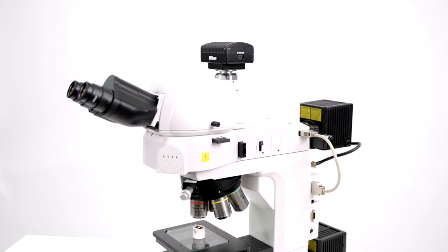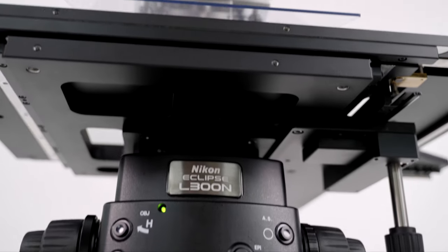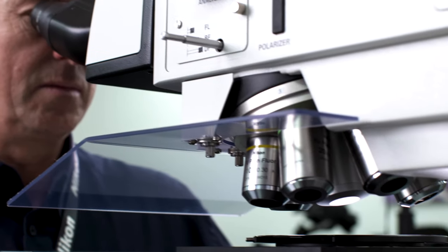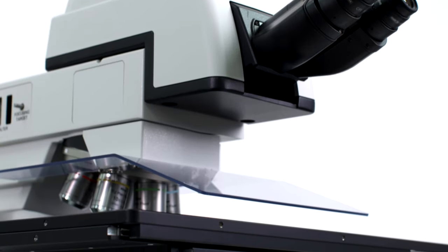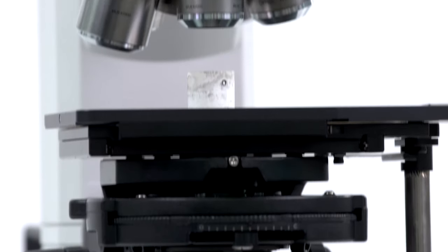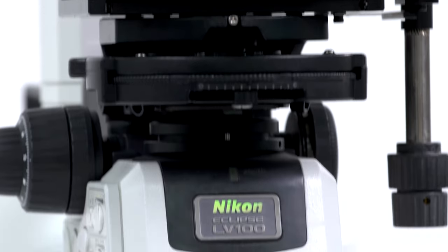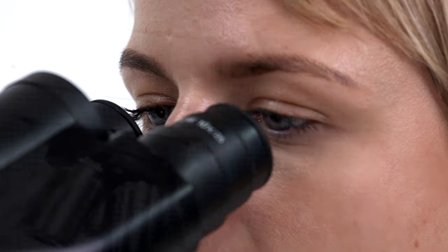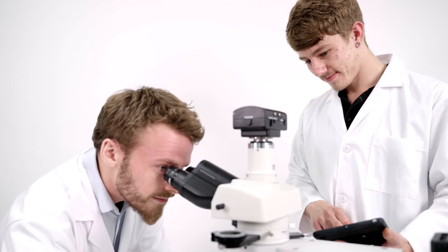Nikon's Eclipse range of compound microscopes are divided into three main stand groups. The L-Series with L200N and L300N models for working with semiconductor wafers of up to 12 inches in diameter are designed for reliable clean room use and to couple with the wafer handler NWL200 for wafers up to 8 inches in diameter. The LV-Series is a very flexible and modular range, with models optimised for reflected light or in combination with transmitted light, as well as dedicated polarised light models.